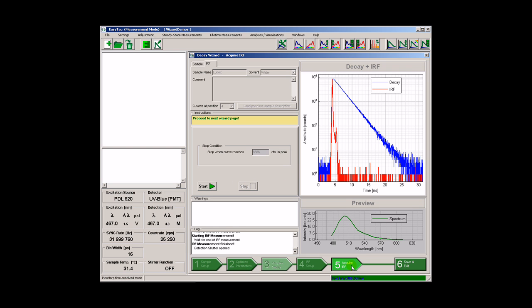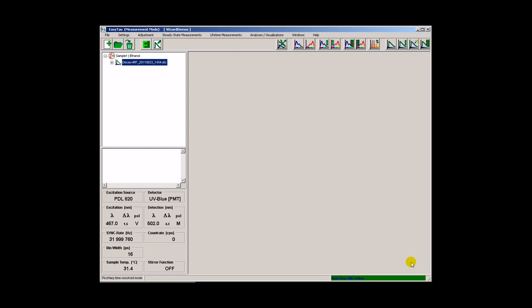At this point, the measurement procedure is completed. We can exit the wizard and the result will be saved and transferred to the workspace.